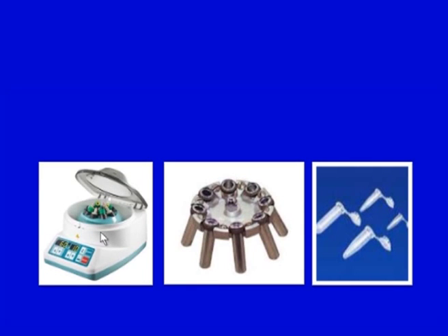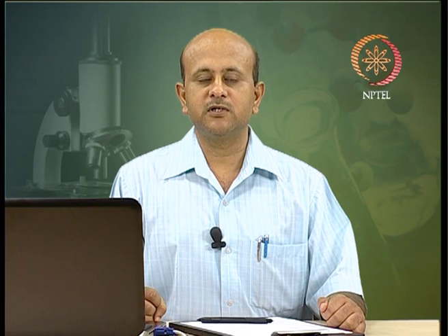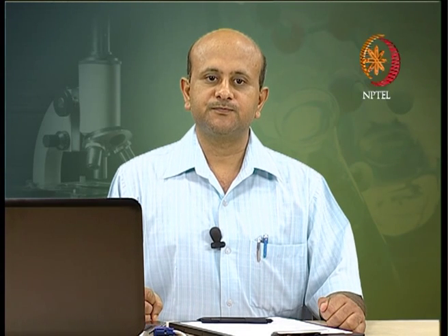If you can see, this is a very small centrifuge, that is a small bench type centrifuge, and this could contain only a rotor with small tubes in there, or centrifuge tube rotors are also available. So, small bench type centrifuges are routinely available in a lot of different research and teaching labs.